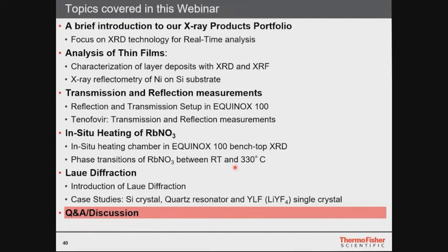If you want to orientate a crystal to cut it in the right direction for some experiments like, I don't know, some exotic magnetic properties or whatever, then Laue diffraction will be very helpful and it will help you to get your job done, and powder diffraction will be of absolutely no help. So it really absolutely depends on the application.